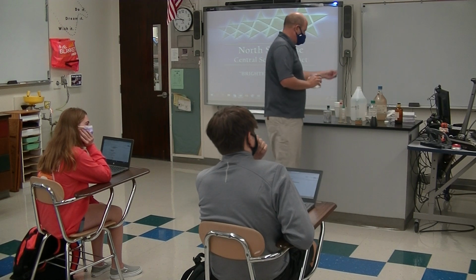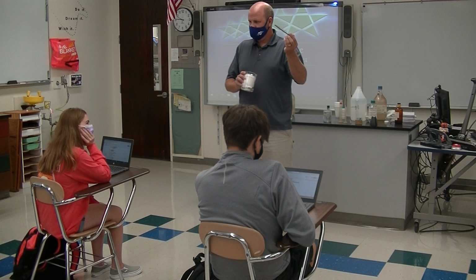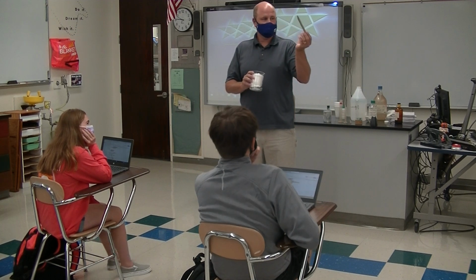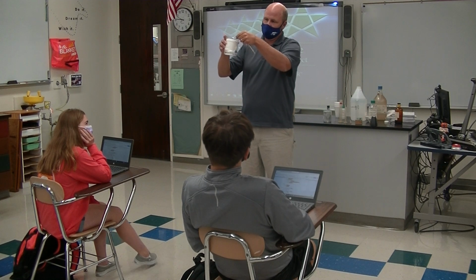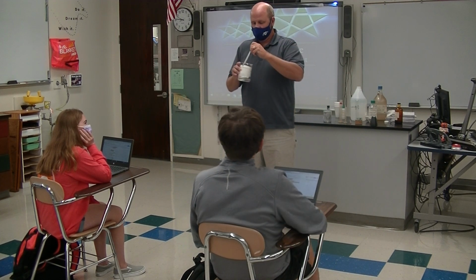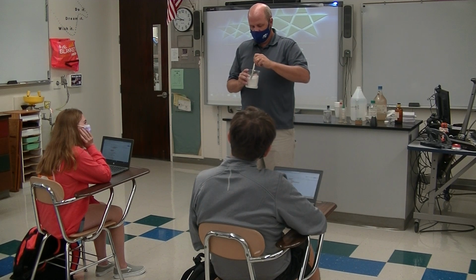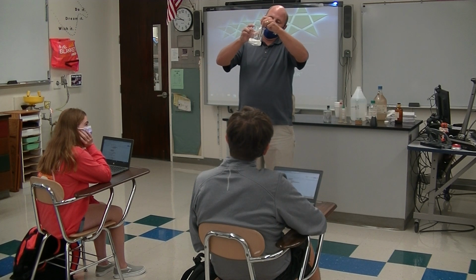I'm going to show you that we can dissolve this whole thing. Remember, what's this called again? This last thing was a beaker. This was called a scoopula. So I'm going to take the scoopula and put this stuff down into contact with it. You'll see that it's not dissolving it.